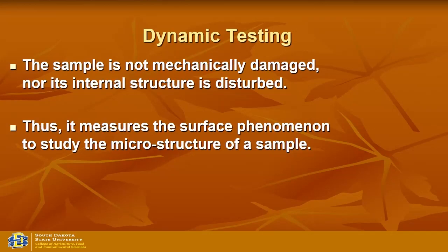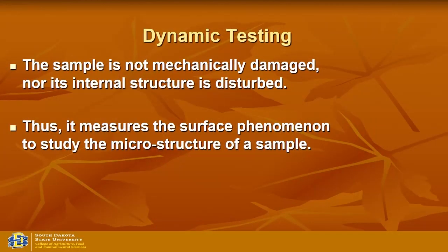So you will really get a lot of new and additional information which will help you with product development. Again, this test takes a lot of time, a lot of patience. We will talk more on that down the road. Thus it measures the surface phenomena to study the microstructure of a sample. So it is much more useful in that way.